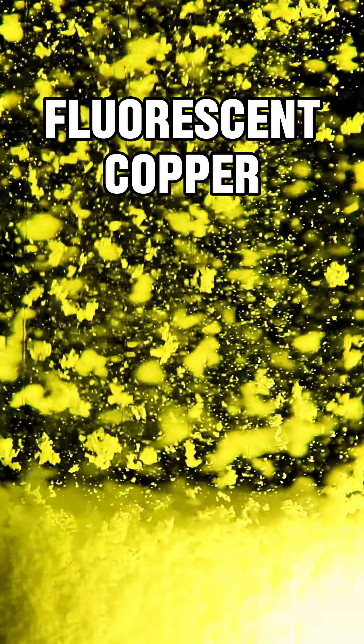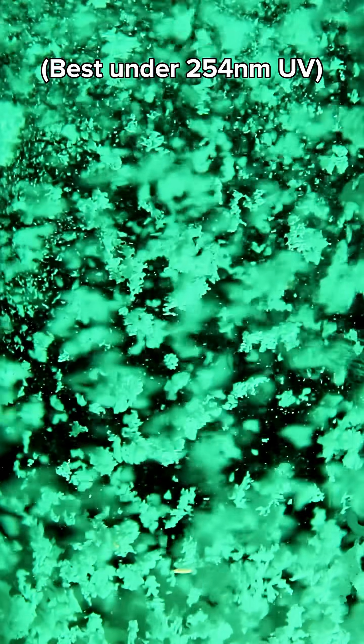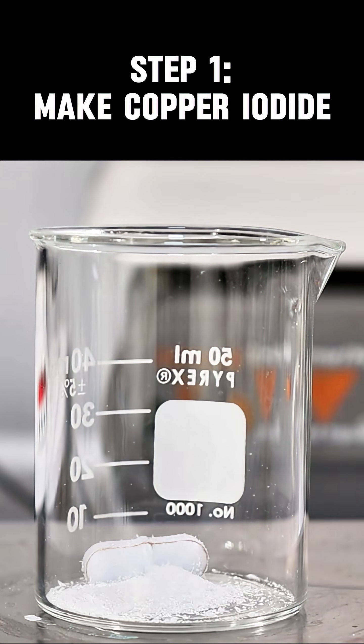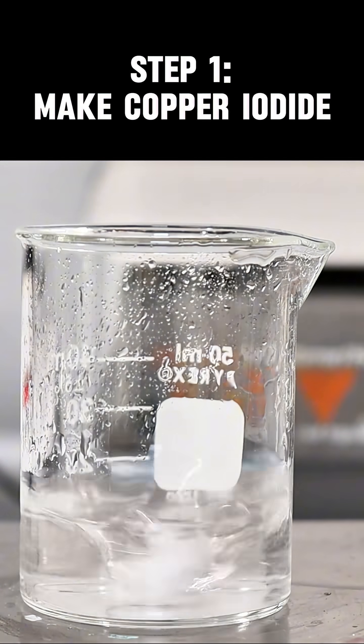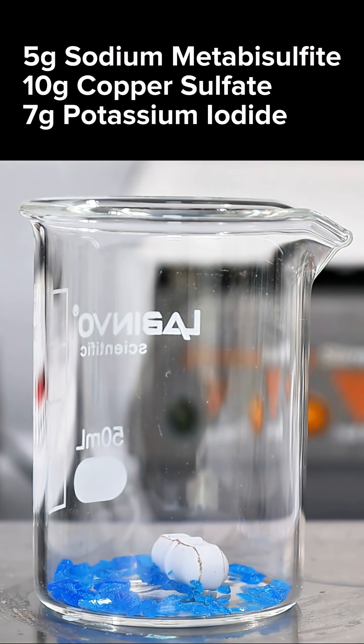Did you know that you can turn ordinary copper into a super bright fluorescent powder? To make this chemical the first thing you need is copper iodide, which I need to make myself from copper sulfate since it's not really something you can easily buy.